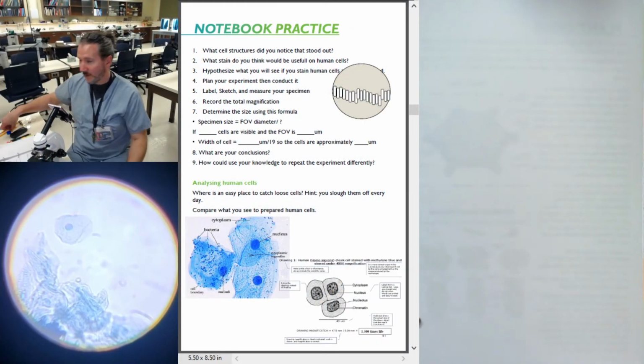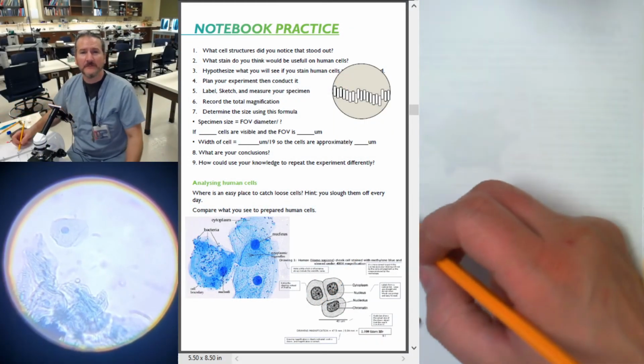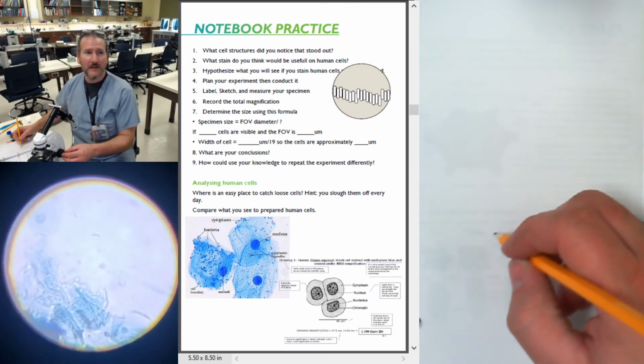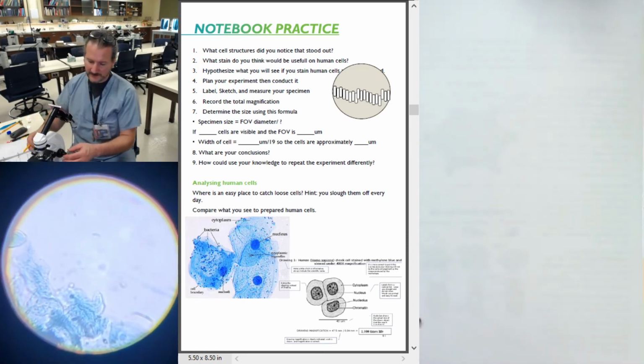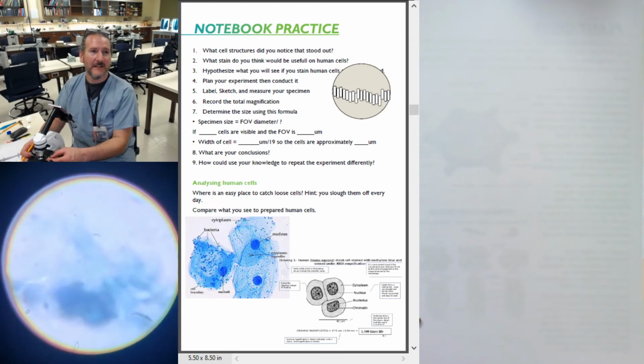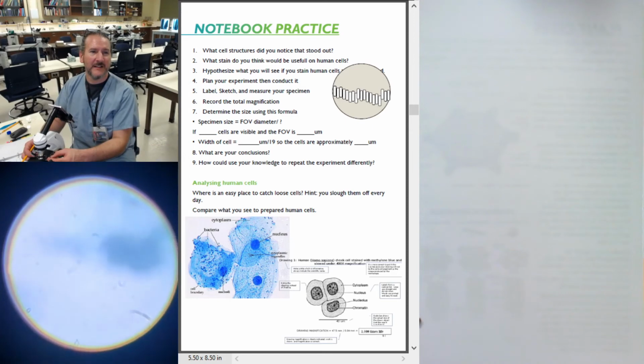So, if I were drawing this, tapping the glass, and I lost it. Oops. Yep. Come back. Air bubble.